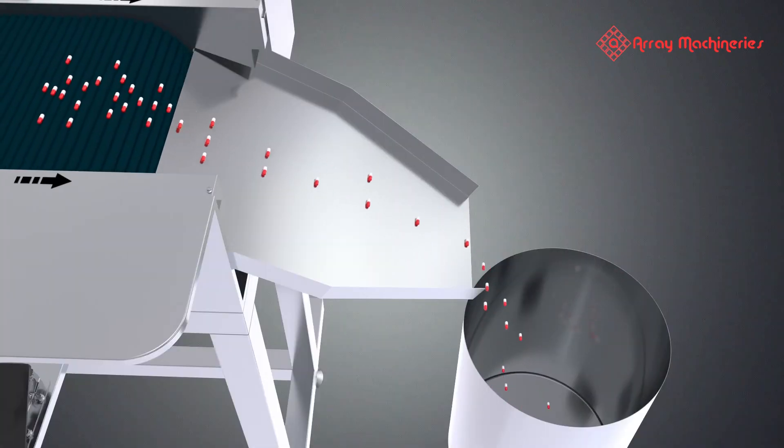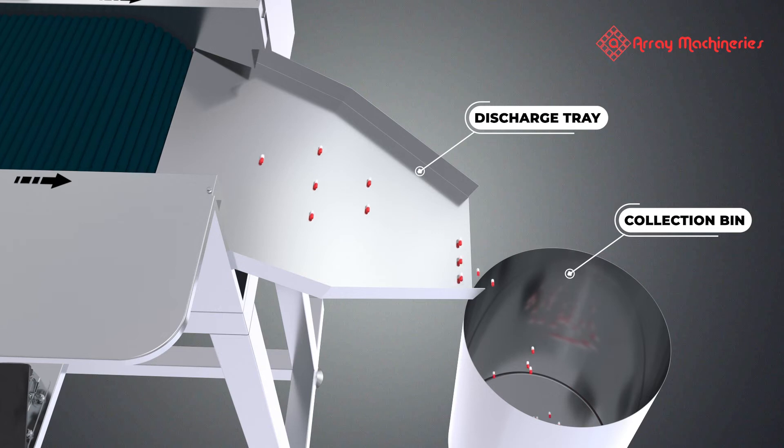The good tablets pass forward and are then collected into the collection bin through the discharge chute.